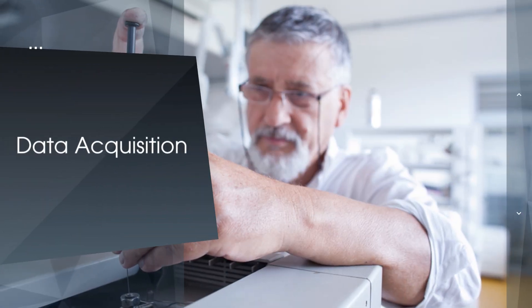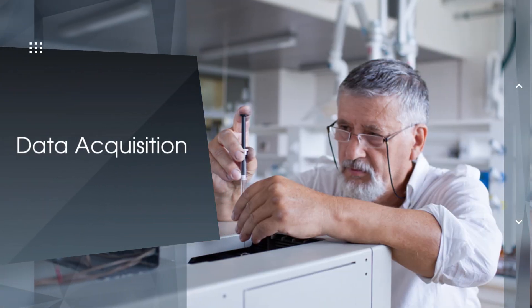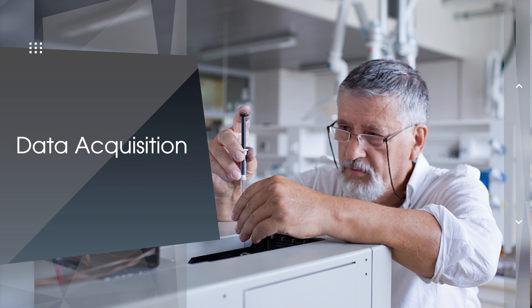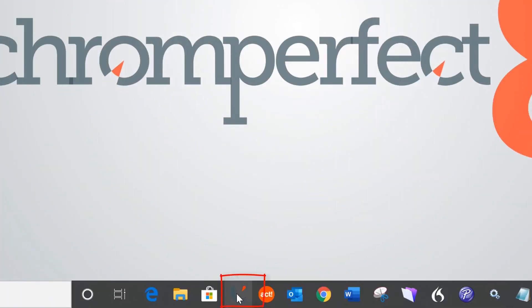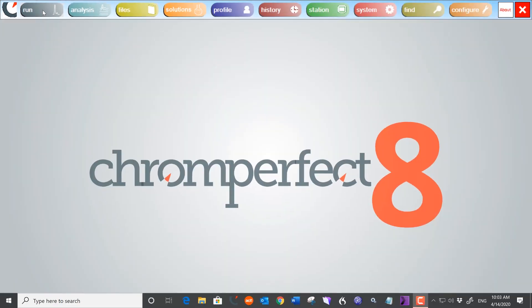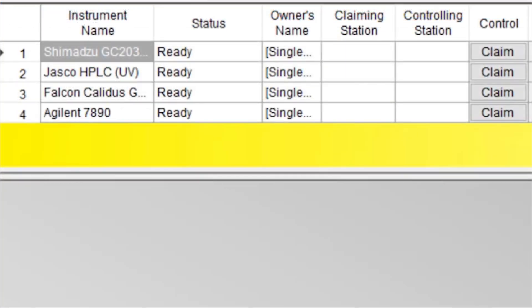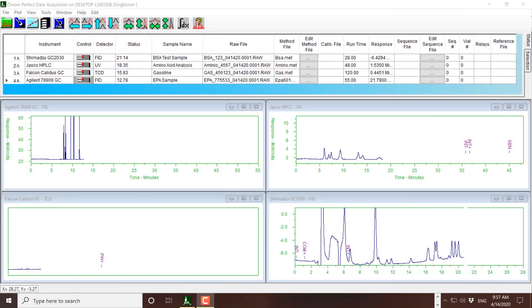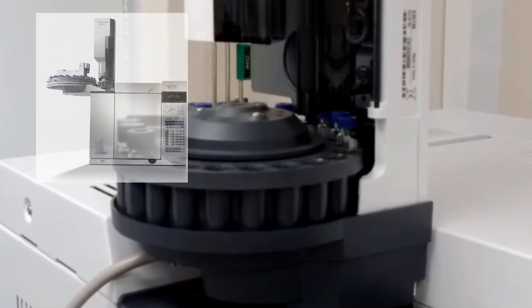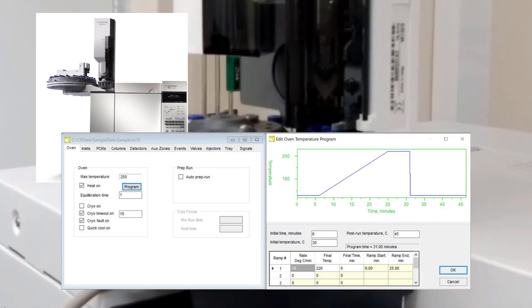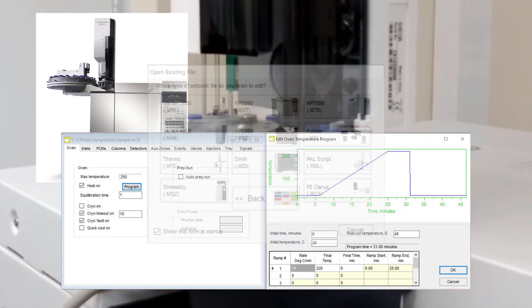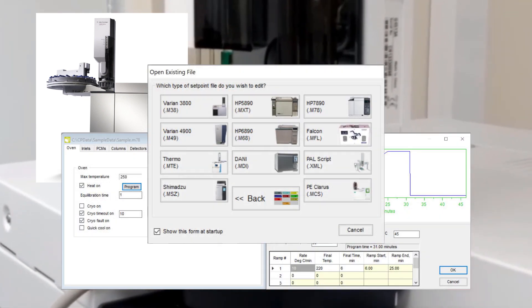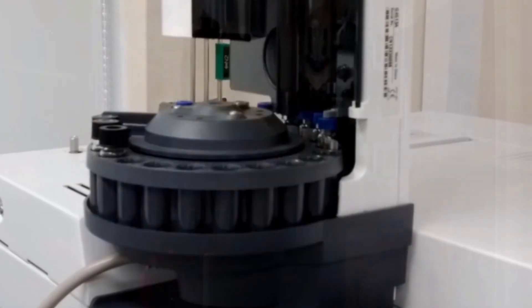Data acquisition and instrument control. Collect data from any chromatography instrument, regardless of age, make or model. Chromperfect drivers offer complete control of your instrument and auto-sampler. New models are being added all the time, and we support the latest instruments from Agilent, Shimadzu, Thermo, Perkin Elmer, Teledyne Falcon, and many more.